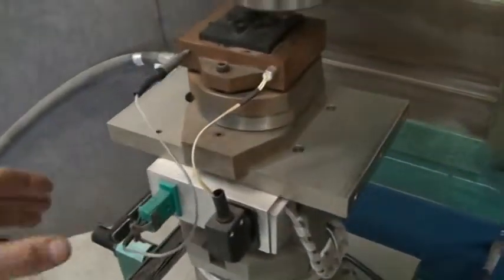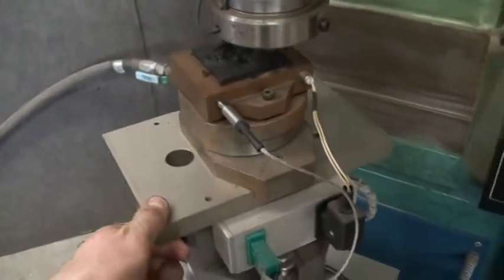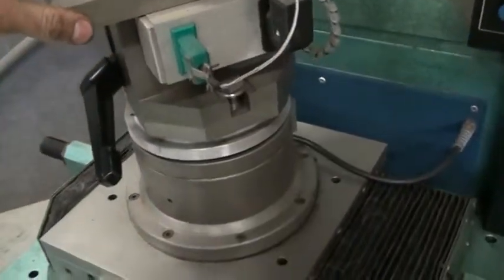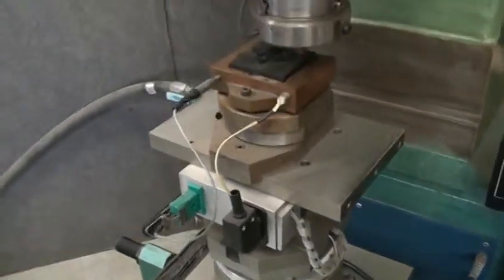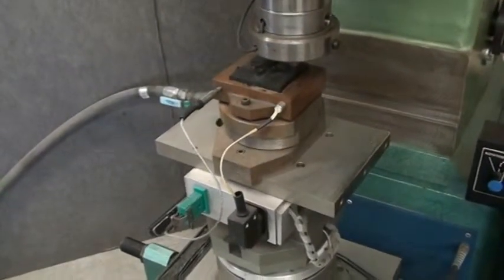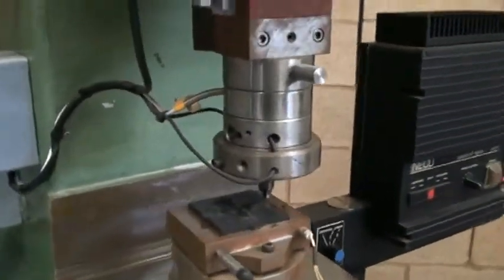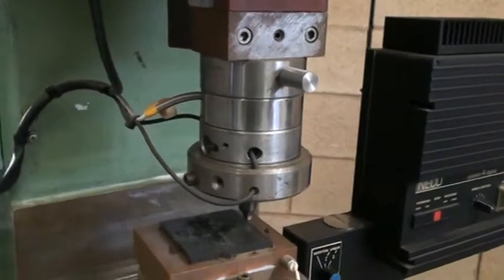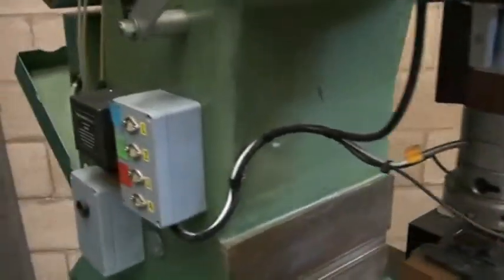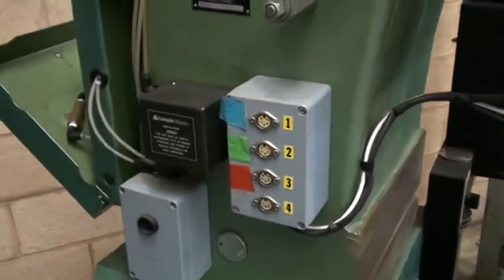Because this whole assembly rotates in rotational mode, there's a slip ring down below for the heater wires and the thermocouple wires. The sensors in the top portion for the load cell come over here to this junction box, and that's where you connect your data acquisition.